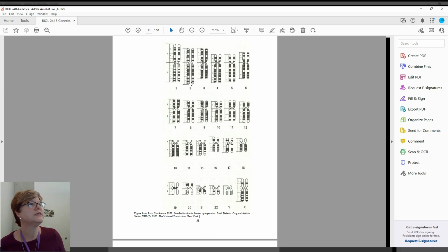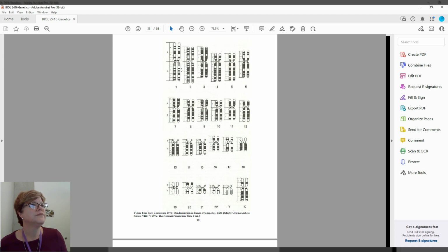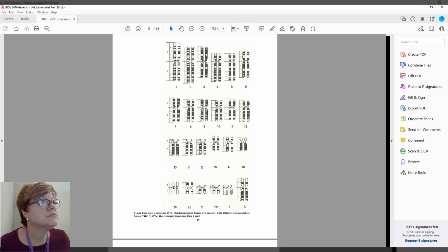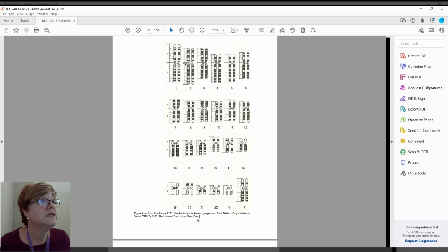This is 2 right here. Then you will find Q, which is the arm that's facing down. It doesn't matter which chromatid you pick. And then 1, 2 would be region 1, which is a really small number here in this sort of broader section, region 1, and then band 2. So it would be the first black band as you're moving away from the centromere.